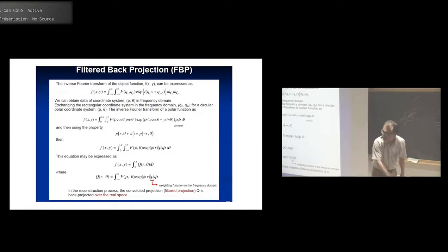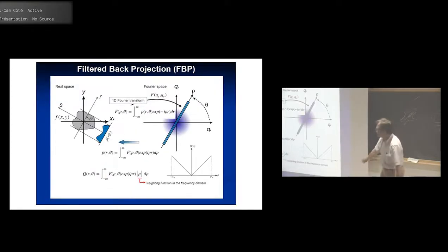I hope you understand. But in the middle, it's always zero. In the middle, you mean here? Always zero, in this direction. So the middle element is never counted in any image. It corresponds to the infinitely large structure, right? Okay. So yeah, it can be zero.